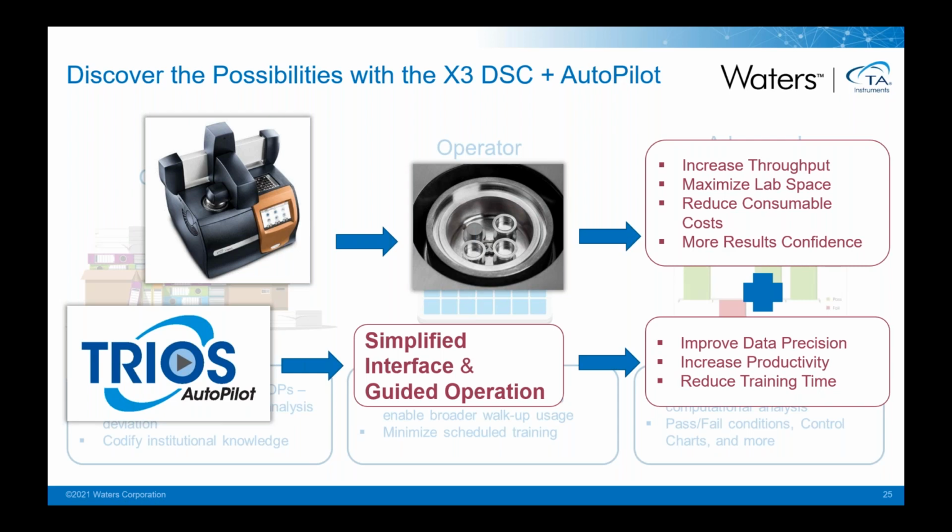Having 3 samples tested at once eliminates the variability of, oh, well, I ran this one day and then I came in the next day and the results were different. Is it because the day was different, or the user was different, or the technician was different? Having those 3 samples run at the same time certainly provides an increased level of confidence in your interpretation and your evaluation.